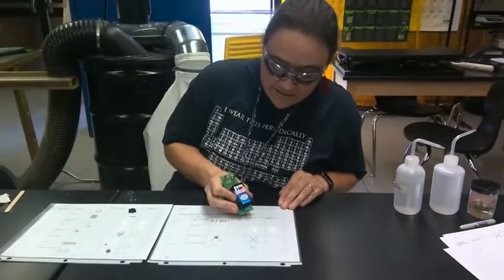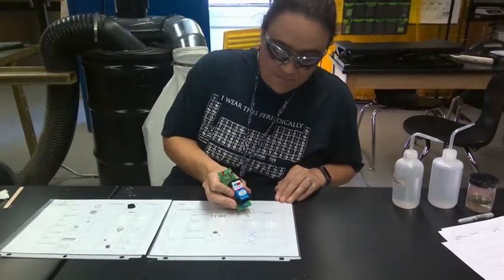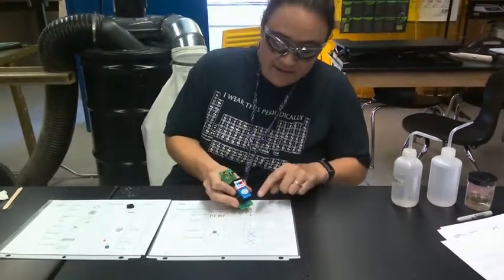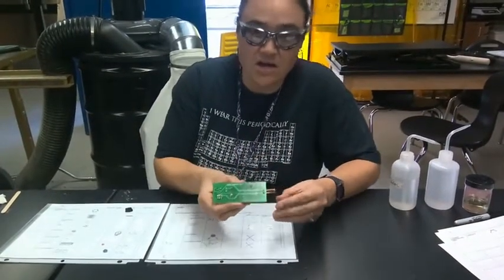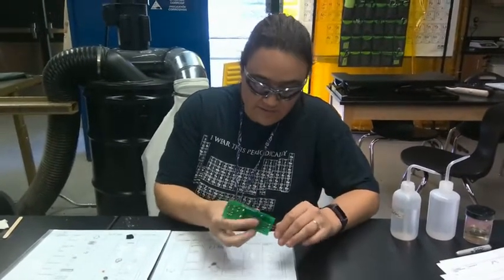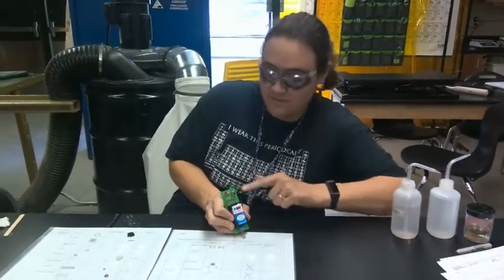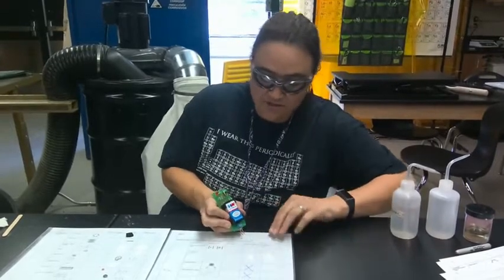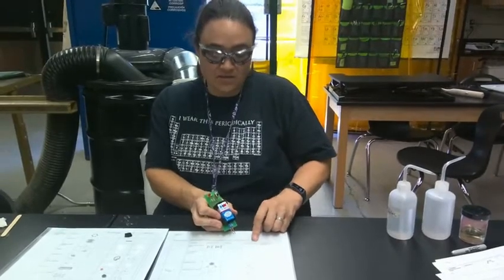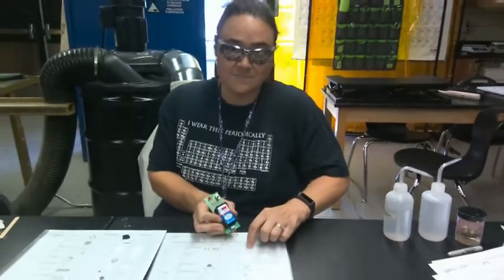First here I have solid potassium bromide, and you can see that when I touch the conductivity meter, there's no change, no lights up here. On the back of the conductivity meter, based on what lights up, the red light, the green light, or both, you can determine how conductive something is. When I touch this salt or a paper, for example, you can see there is indeed no change. So on your workbook page where it says conductivity as a solid, because we see no lights turn on, I would write none in this box.